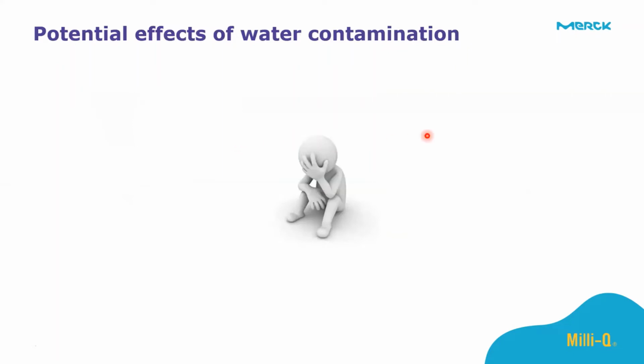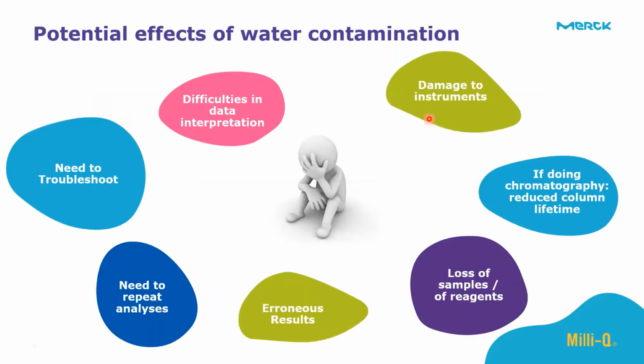So the potential effects of contamination. What is likely to happen when you have contaminants in the water that you're using for experiments?